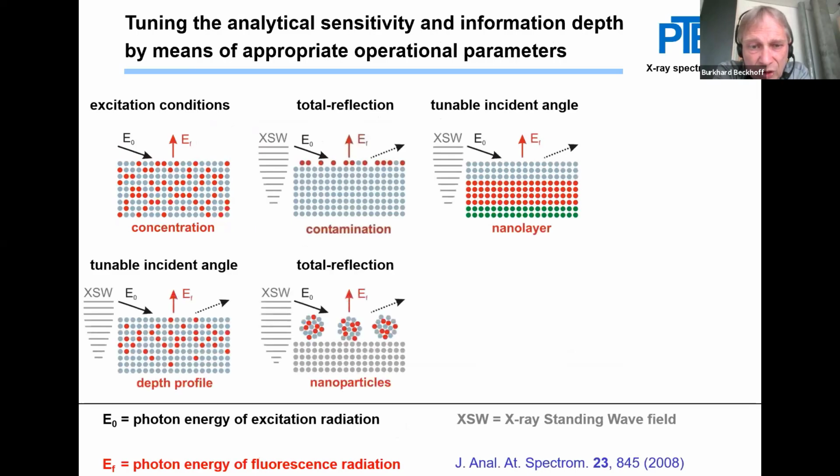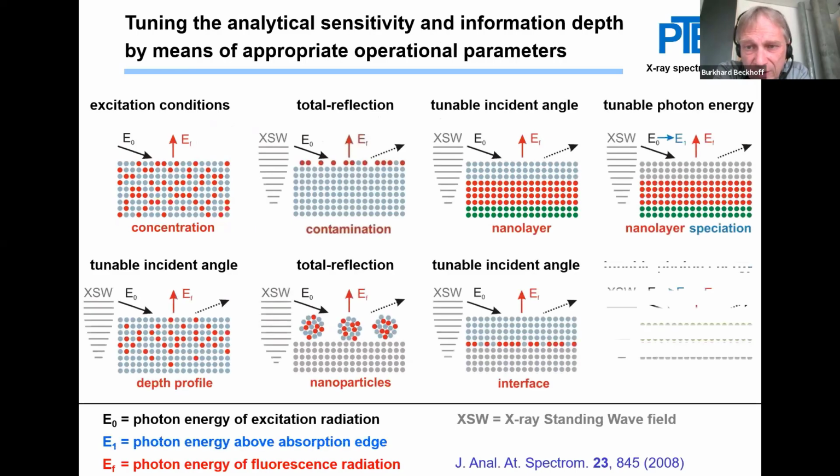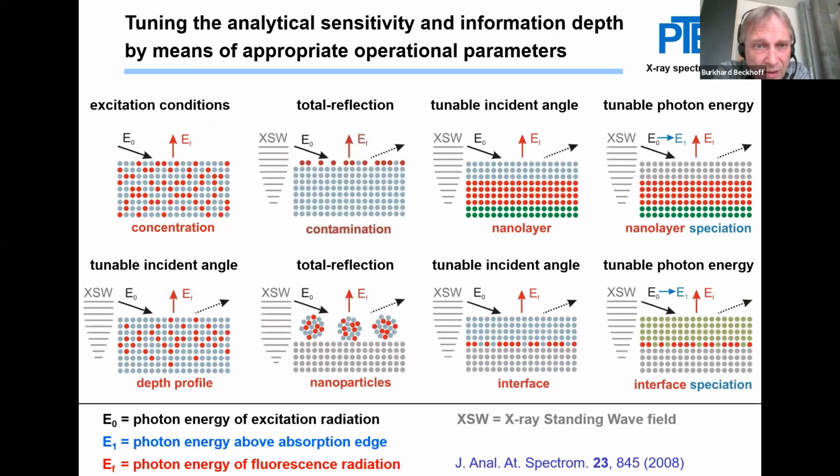So this is a very short survey of what can be done with TXRF and related measurement techniques. So traditionally, the incident photon energy is the main operational parameter that is being changed in XRF analysis.